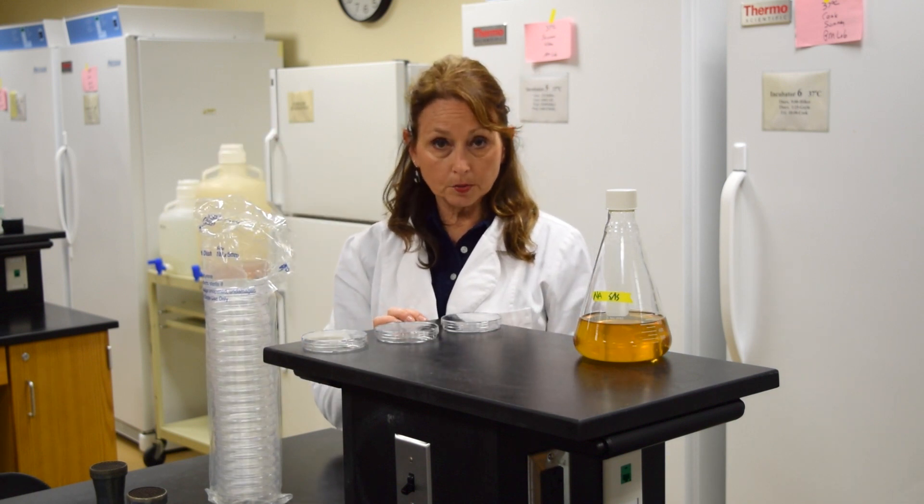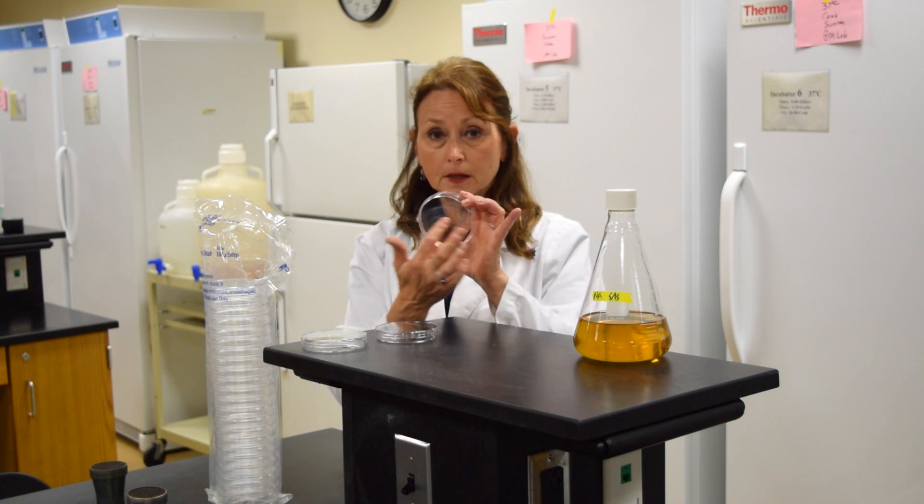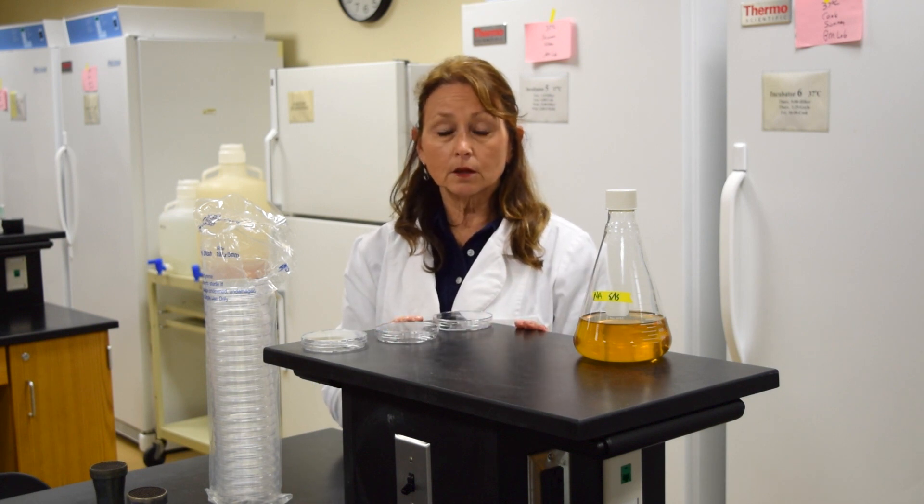When you're ready to pour the plates, you should have the plates labeled with your initials and what the media that you're putting into the plate is.